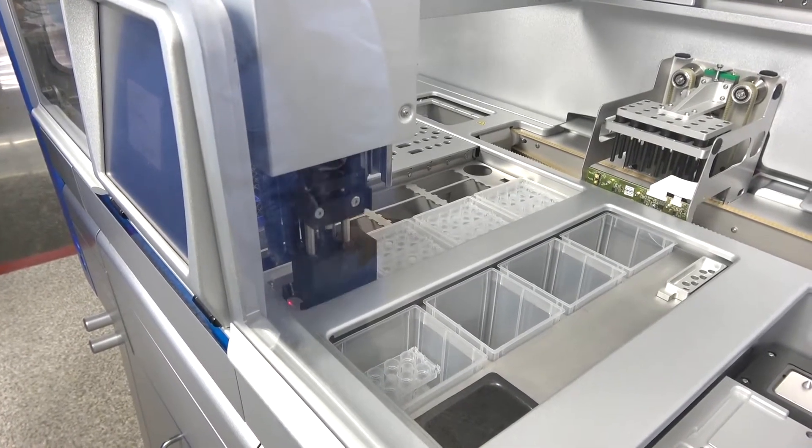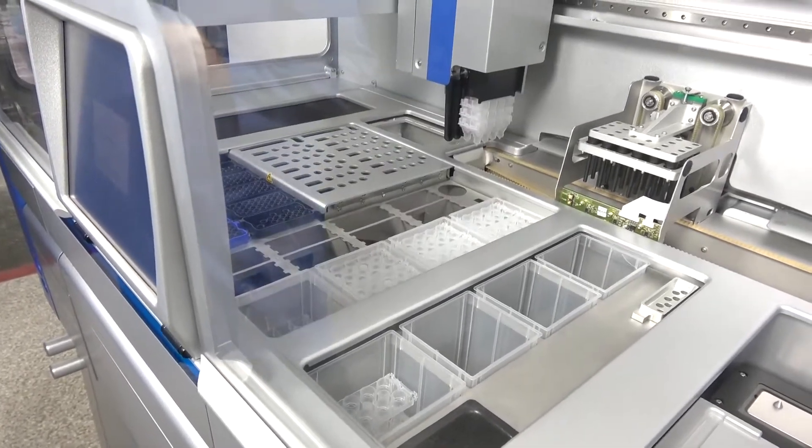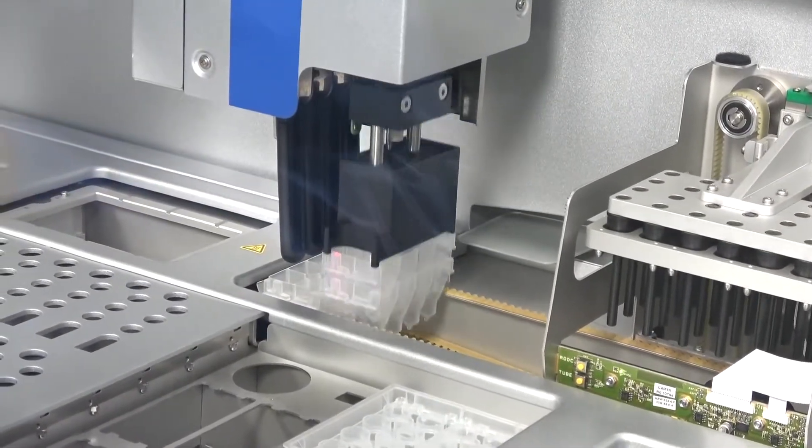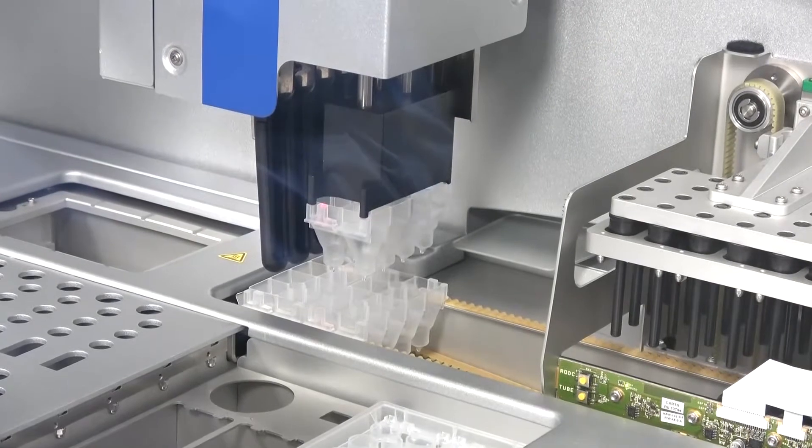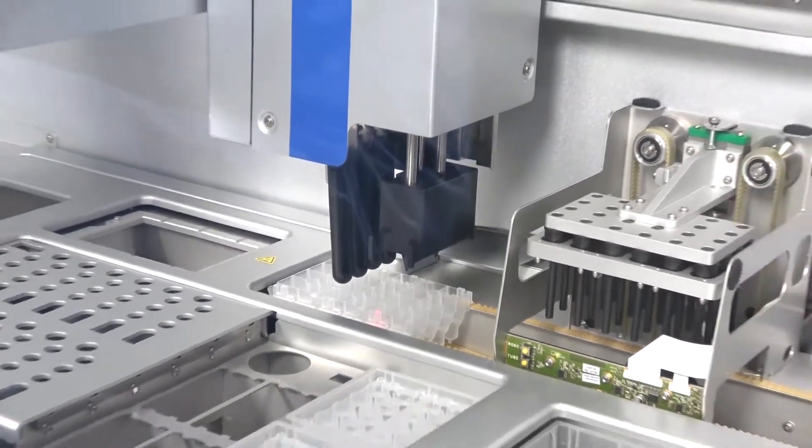There it finds it, goes ahead and reaches. It grabs actually three of these units, brings it back to the conveyor belt, drops one, goes and puts the other one in the third position, and the third. So we know it's very accurate setting the system.